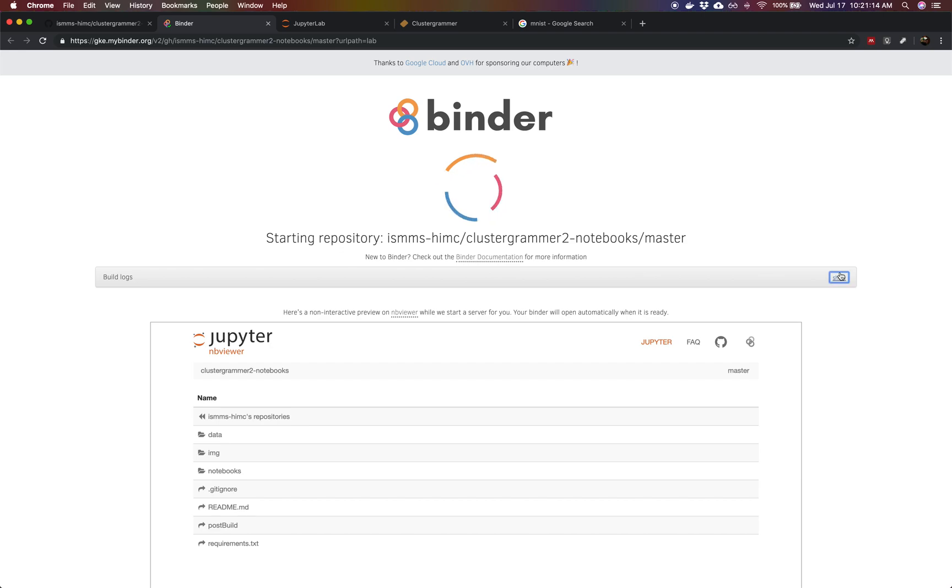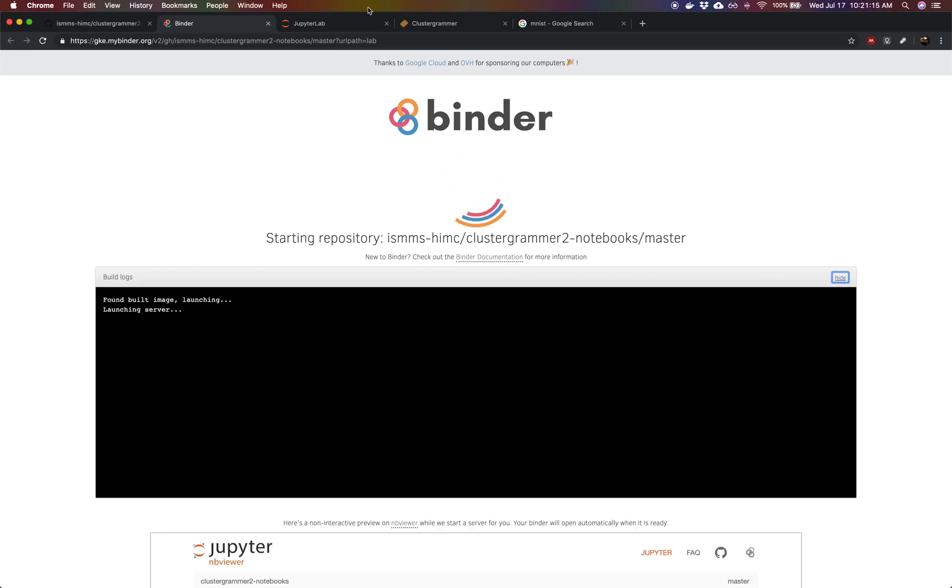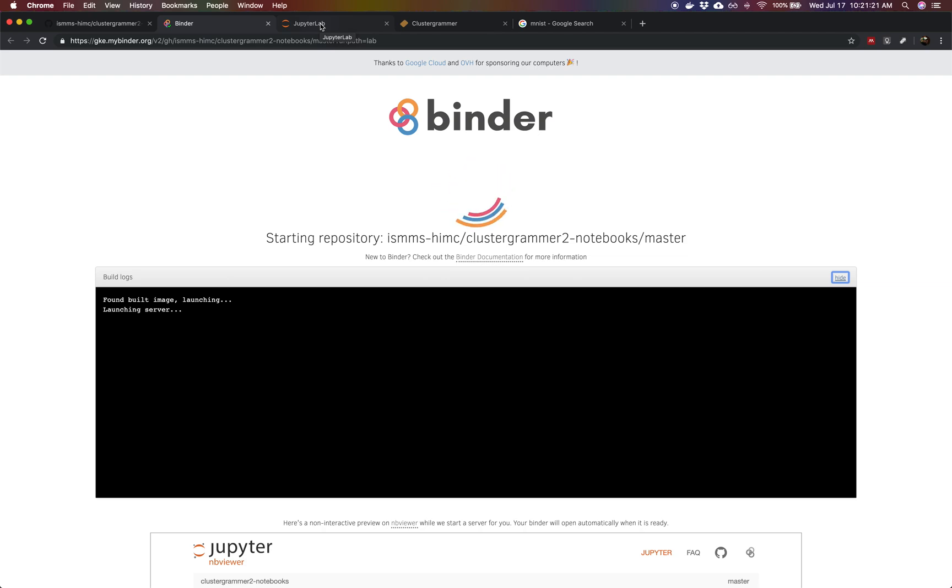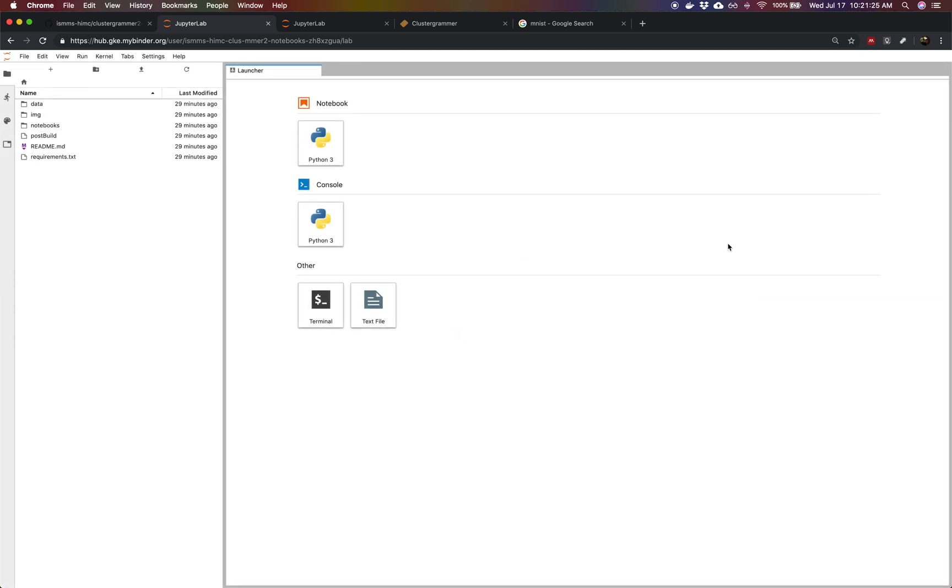This can take anywhere between 30 seconds to a few minutes to launch, depending on whether the image has been built. Now we have JupyterLab starting. This is the new interface for Jupyter that is being built, the new front end.